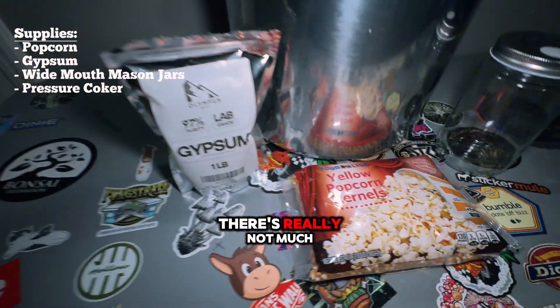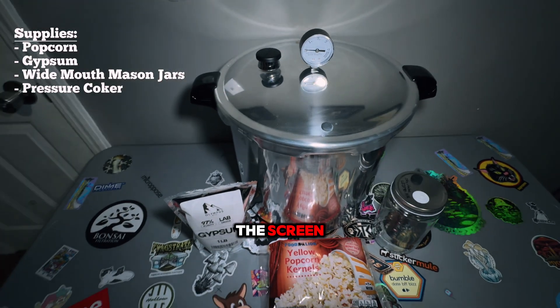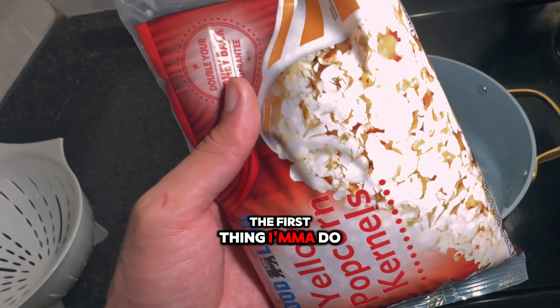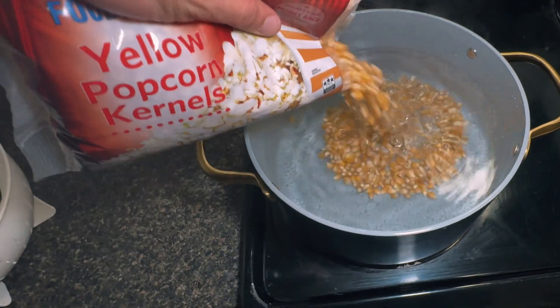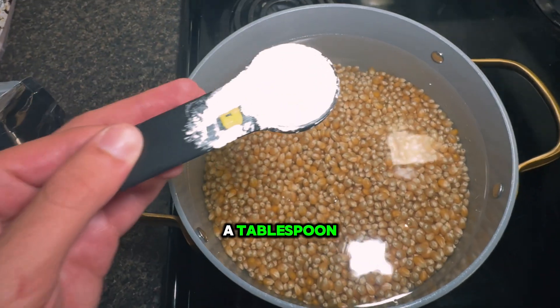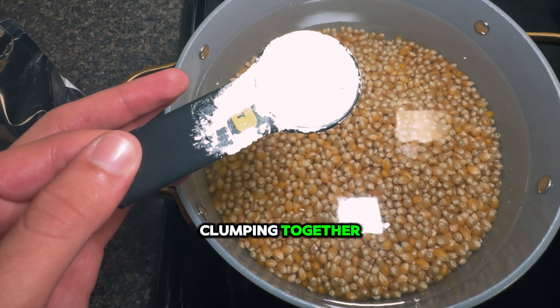Here's all the supplies you'll need — there's really not much, but there should be a list of everything on the screen. The first thing I'm gonna do is add this popcorn to the boiling water. I'm also gonna add a tablespoon of gypsum to keep it from clumping together.